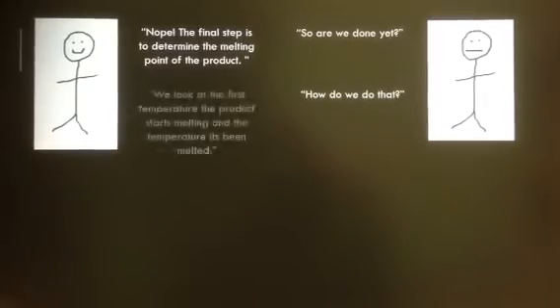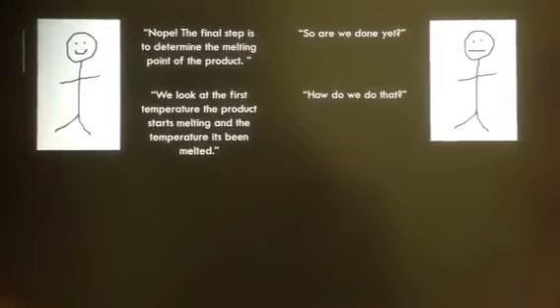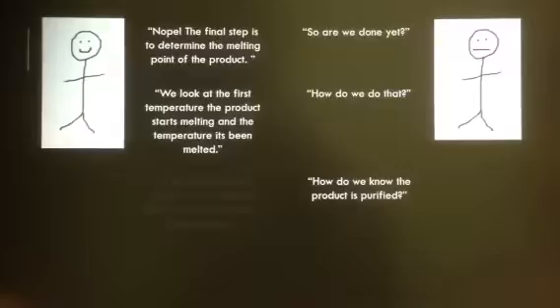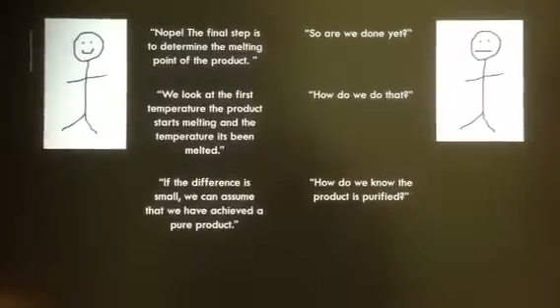How do we do that? We look at the temperature at which the product starts melting and the temperature at which it has completely melted. How do we know the product is purified? If the difference is small, we can assume that we have achieved a pure product.